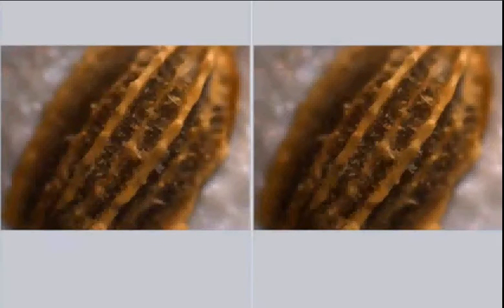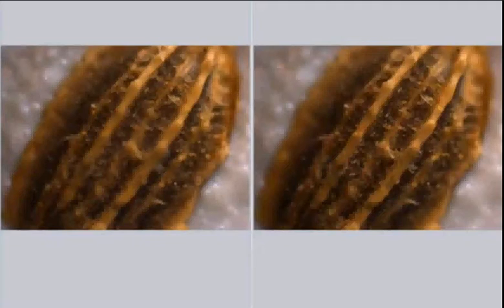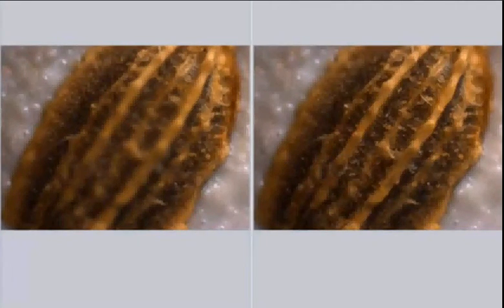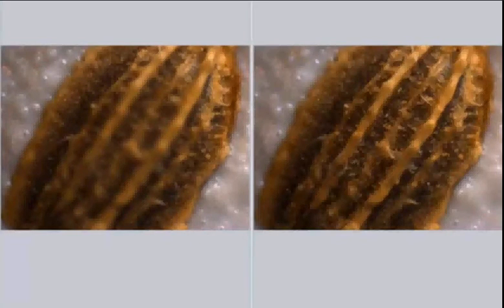A typical image like this might take 10 or 15 seconds at most. If you notice, by the time I get to the bottom of the focus on Live image, the top portion of the seed is out of focus, but our EDF image is fully in focus.